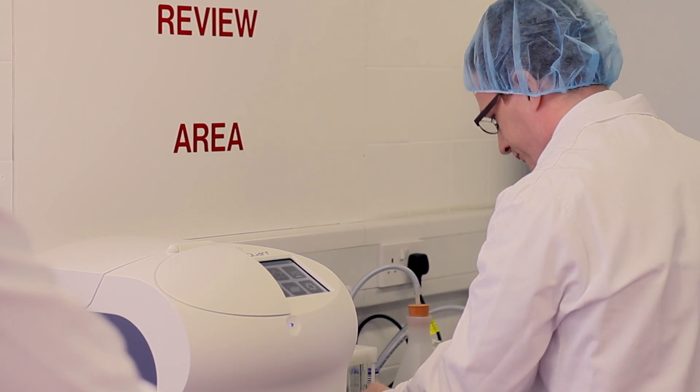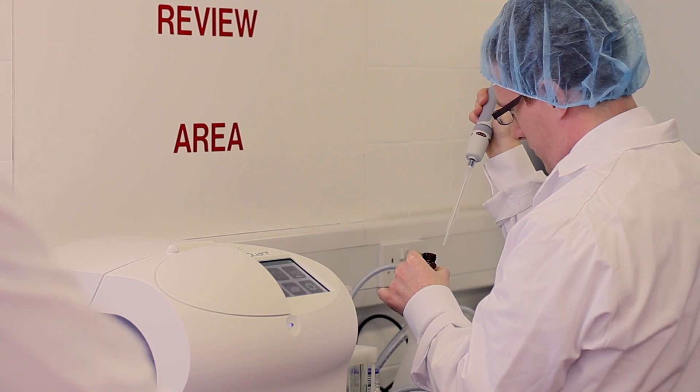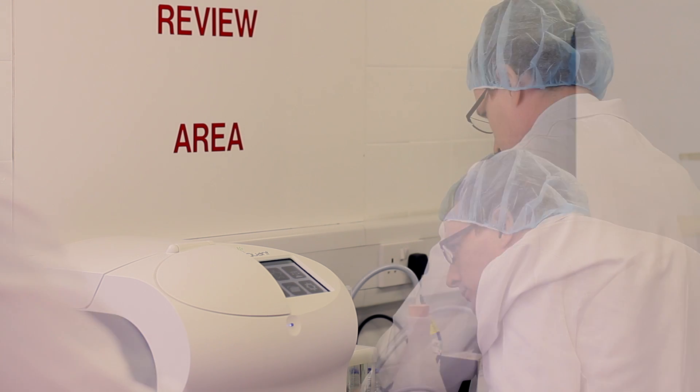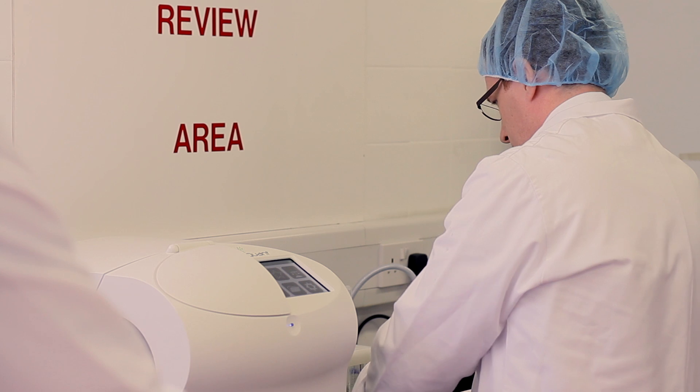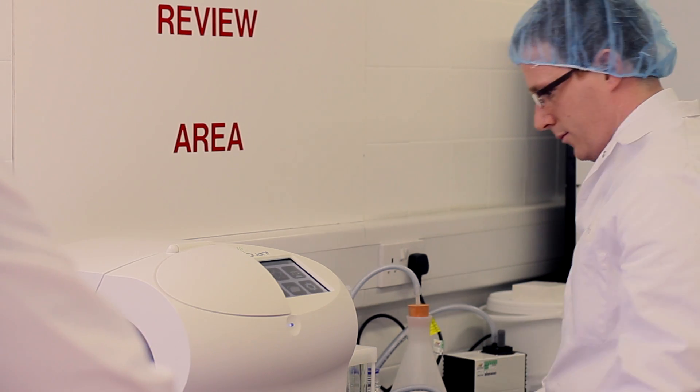So there's more advantage obviously versus HPLC. As you can see, we use 0.4 milliliters of solvent versus liters you have to use for everyone. So it's environmentally friendly, and not only that, it's less cost as well — you don't have to get rid of the solvents, you don't have to collect them so often.